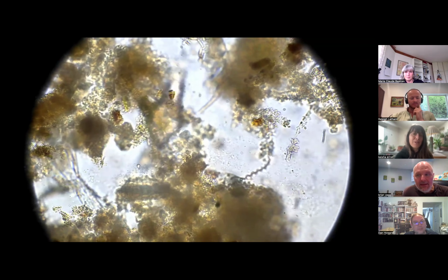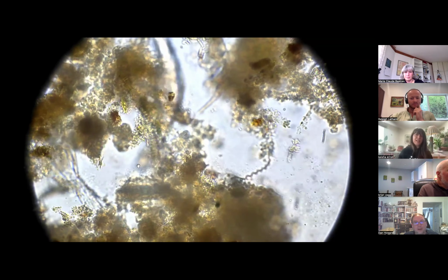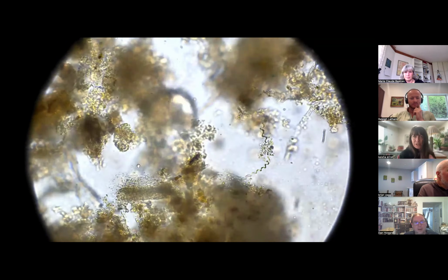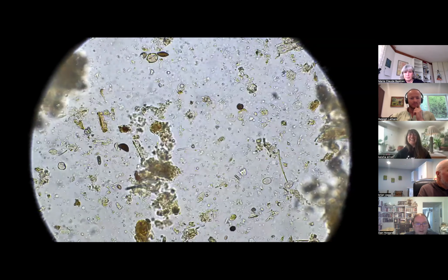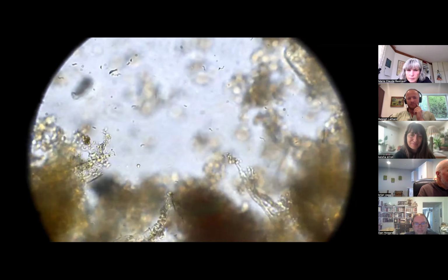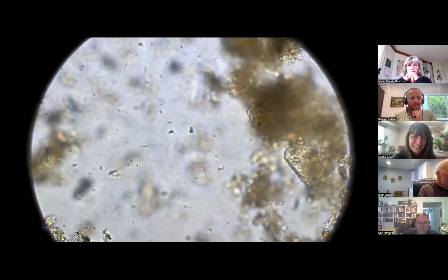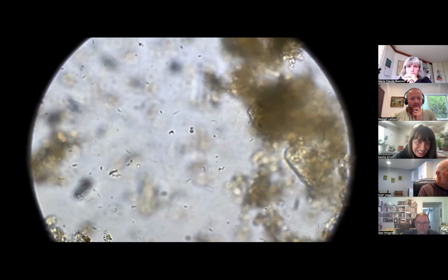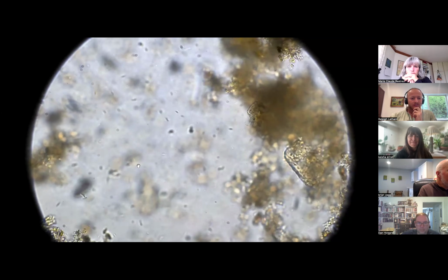Sometimes we have people that'll be panicking about their compost. They're like, "Oh my, I found something in my compost that's scary and crazy." And we're like, okay, give it some compost extract and wait an hour, check it again. These ecosystems can move quick. It's almost like it's a giant music festival and they're cleaning up. Here we go. There they are in great number. They're hunting in packs today.